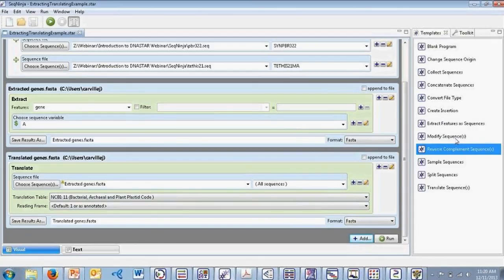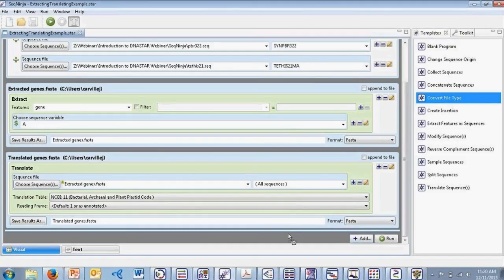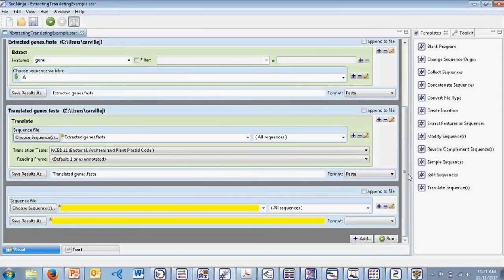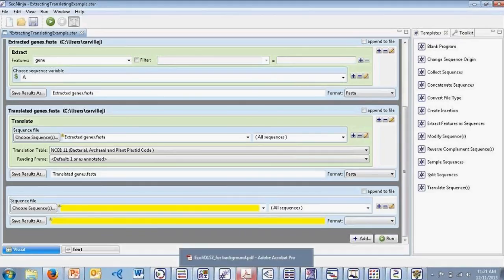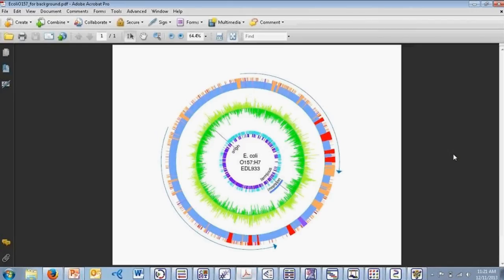Other available functions in SeqNinja include the ability to convert file formats, batch edit and export annotations, merge and split sequence data, and transfer annotations between genome versions. It's very easy to add or remove from your script — you can simply drag a function right onto the visual screen. The second application included across the evolution, genomics, and structural biology suites is our GenVision application, our genomic visualization application designed to support the creation of publication-quality graphics. What we're looking at here is a PDF output from GenVision showing a nice circular map of the E. coli genome. This application is endlessly customizable and can illustrate and visualize large and complex data sets.